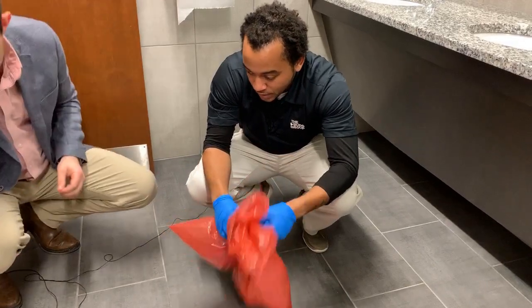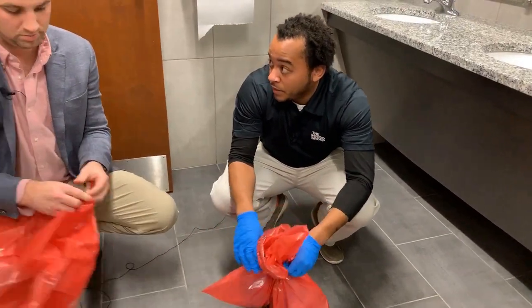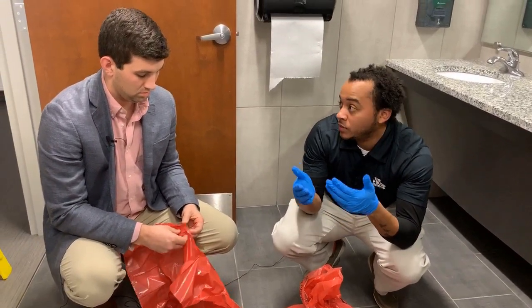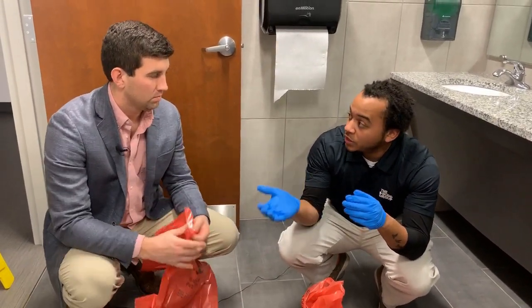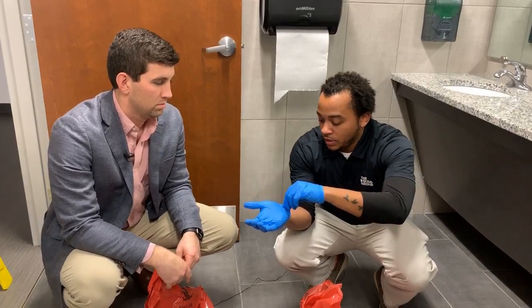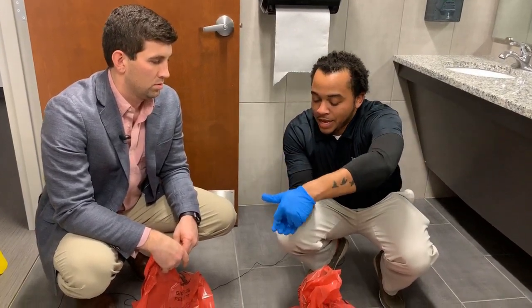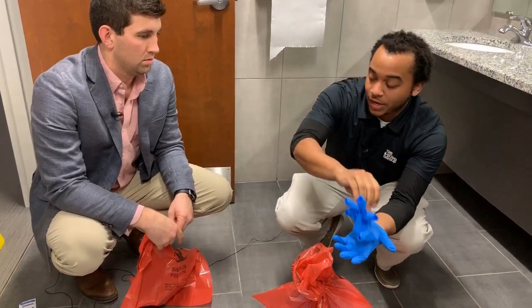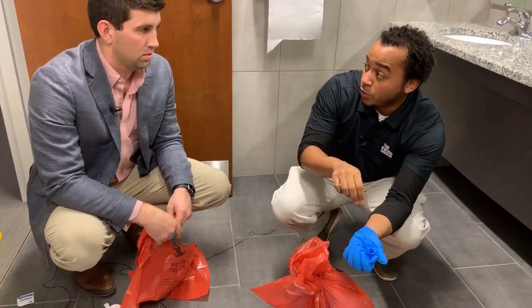And then, very imperative and important, when you're doing this last step, is how you take these gloves off. Okay? So you're going to take the first glove off inside out, and you're going to place that in the hand with the glove on.